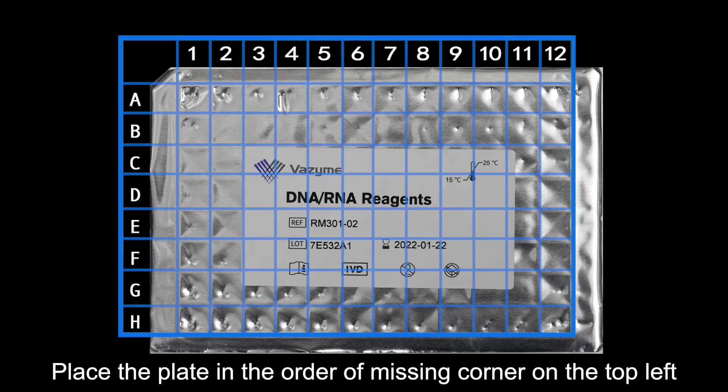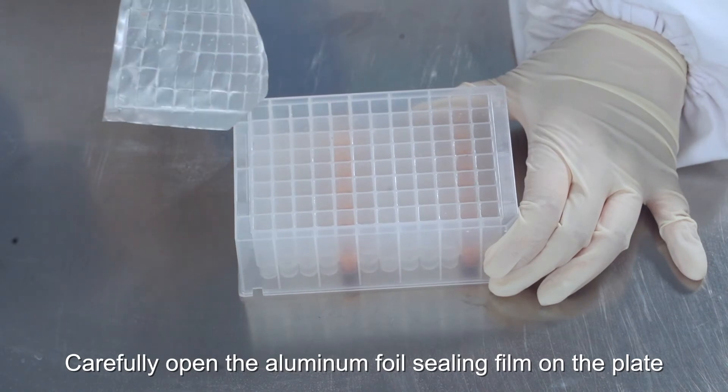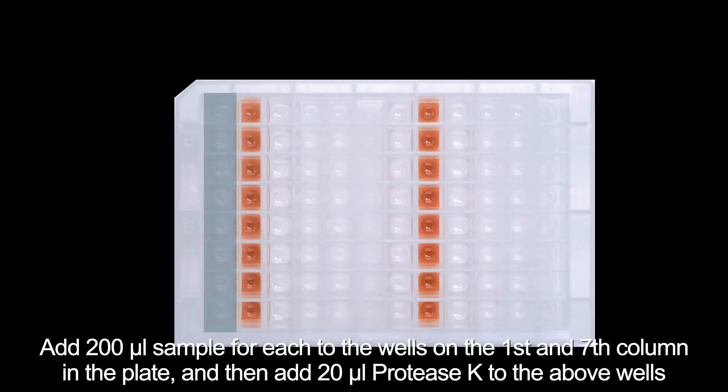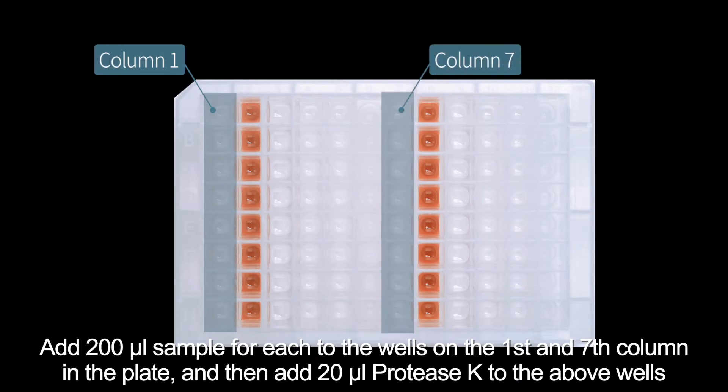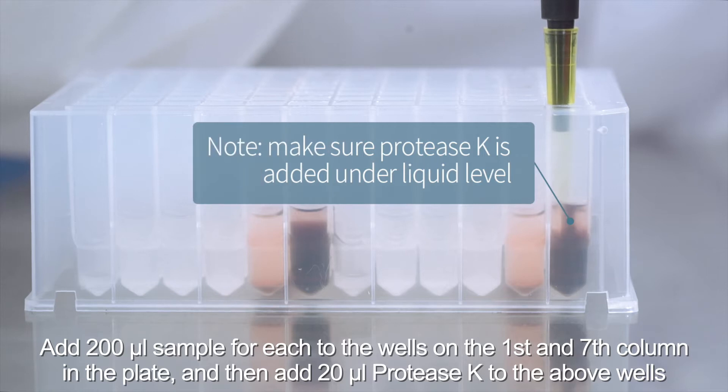Place the plate with the missing corner on the top left. Carefully open the aluminum foil sealing film on the plate. Add 200 microliters of sample to the wells in the first and seventh columns of the plate, then add 20 microliters of Protease K to those same wells.